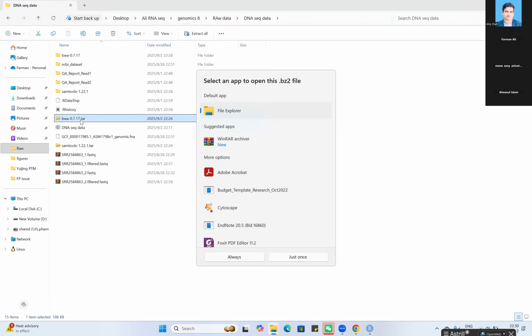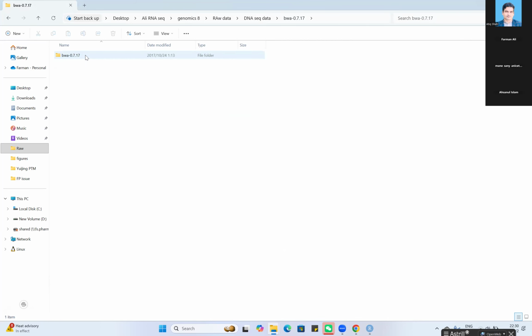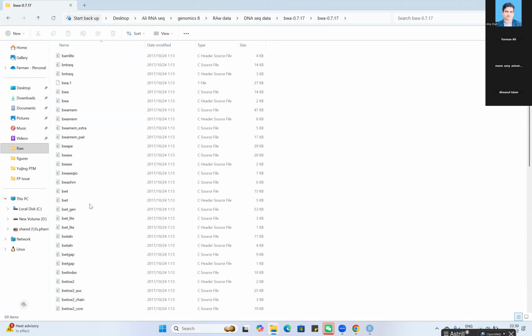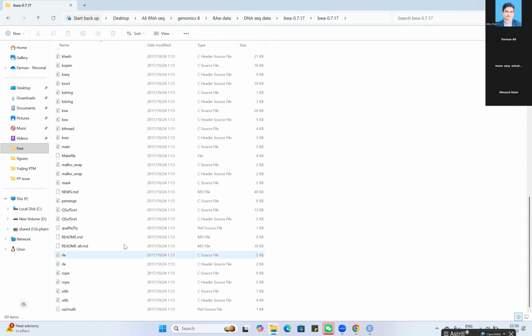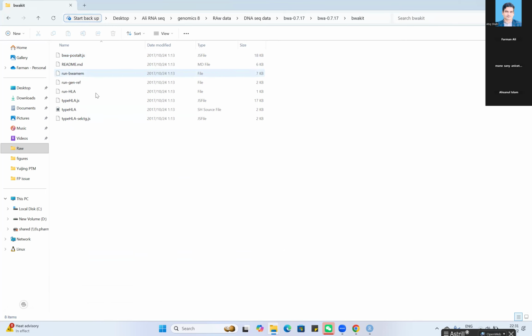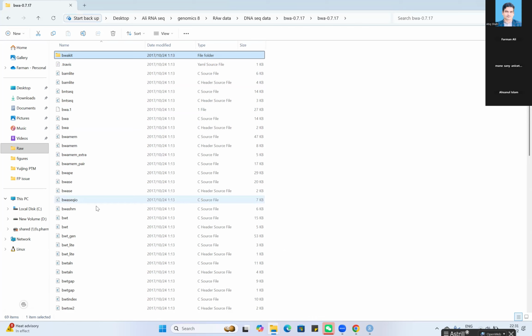Your first folder is BWA. Again open. There should be an exe file. Open BWA kit. If not here, check here for the exe file. There is no exe file here. Okay, now again come to ChatGPT.